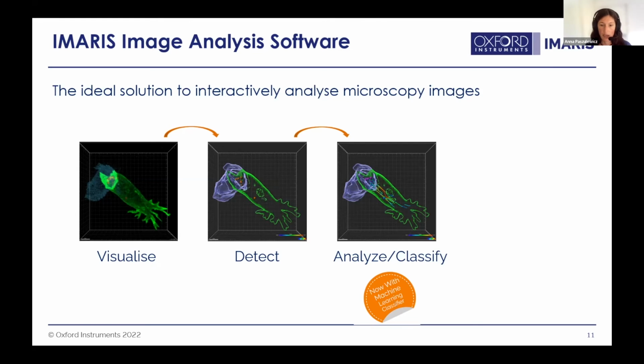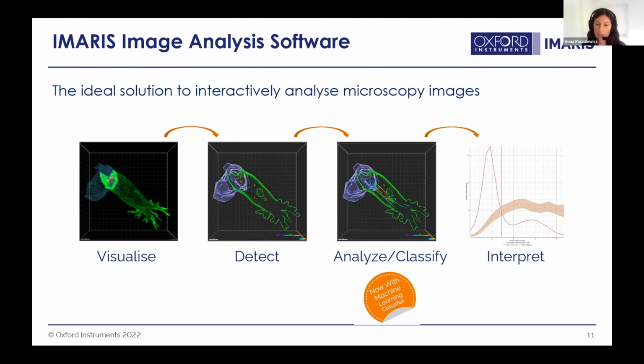The classification is, of course, nicely done using machine learning classification method, which enables you to include a lot of parameters you don't even think are important, but you can mark and brush the objects you need on the image, and the software calculates the classes for the rest of the objects. And the last and very important step I focused on today is the actual interpretation of the results. So not only the segmentation, which, as I mentioned, is just the first step, but also getting the reliable and conclusive information from the data ready to be published or compared with other samples.